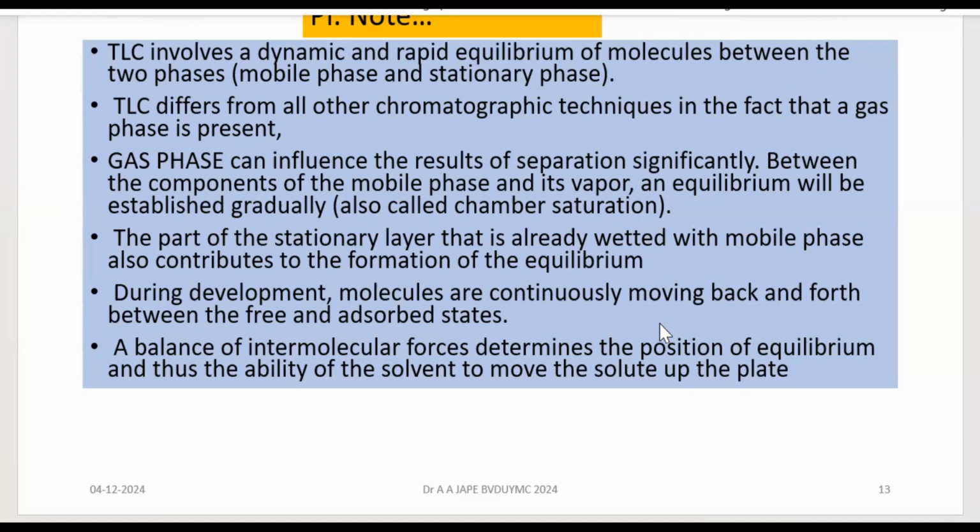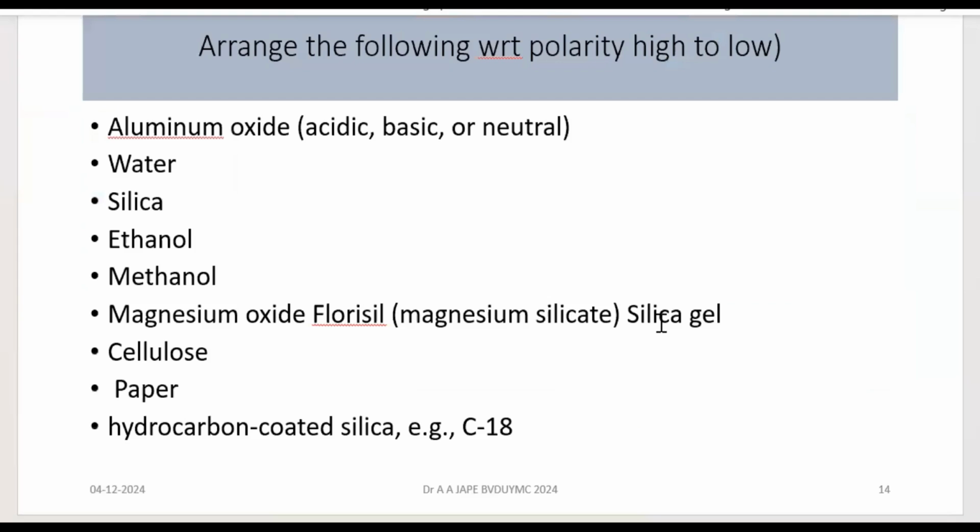A balance of intermolecular forces is going to determine the position of equilibrium and thus the ability of the solvent to move the solute up the plate. So, selecting the right solvent system and preparing a saturated chamber are the key steps when we talk about the mobile phase of TLC chromatography.